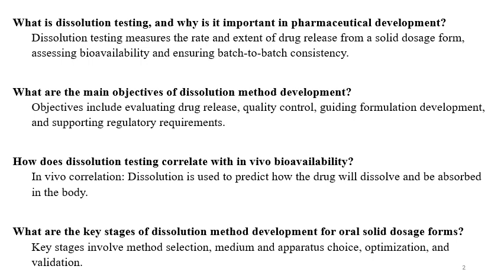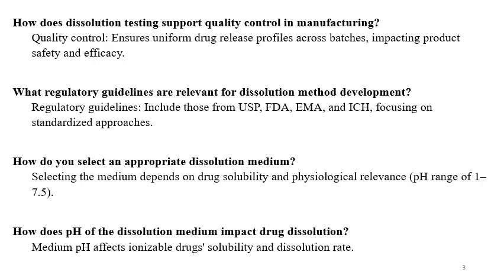What are the key stages of dissolution method development for oral formulations or oral solid dosage forms? Key stages involve method selection, medium and apparatus choice, optimization, and validation. After this, the method is transferred to the QC lab.